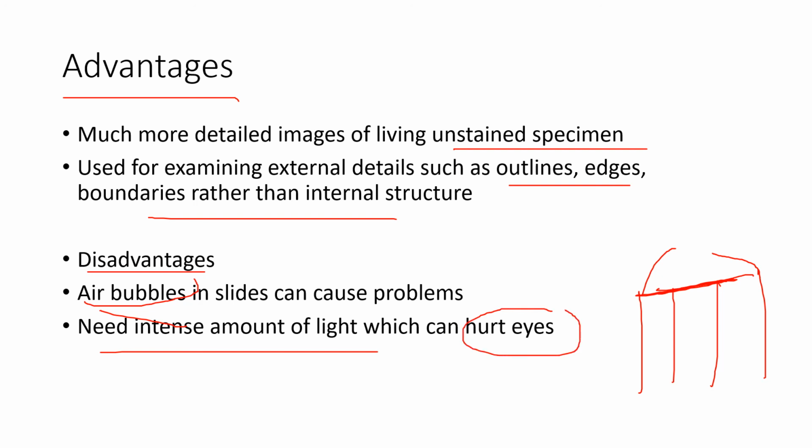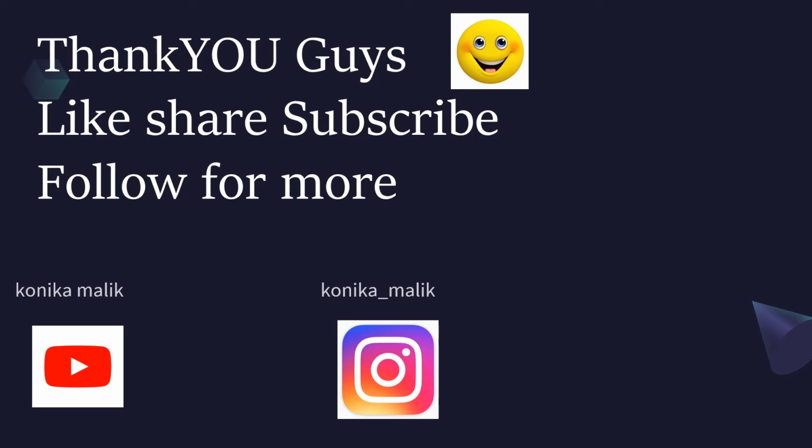So that's why we use a laptop to see the images. Like we have seen in the first slide, a laptop was connected to a dark field microscope. So we usually avoid looking directly into the images like with binocular microscopes, because it might hurt our eyes, which is kind of a drawback for the dark field microscope. And that's it guys, we have covered dark field microscopy.